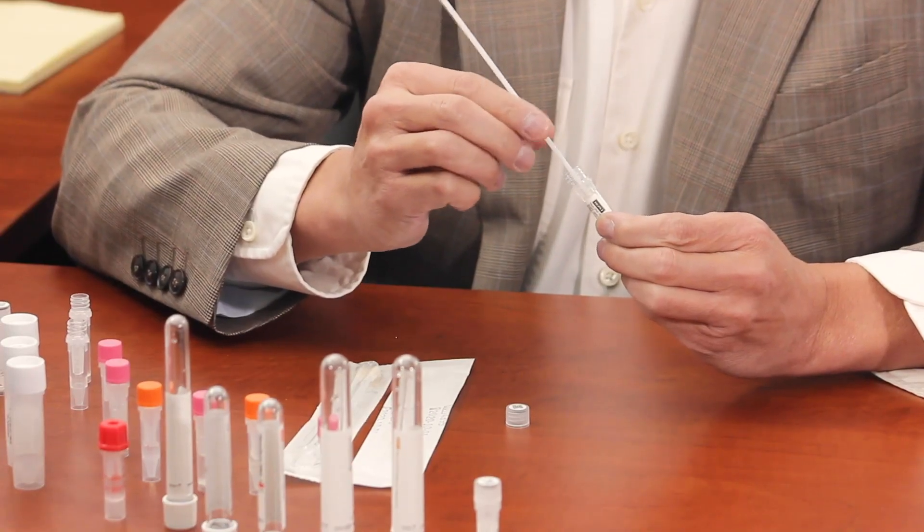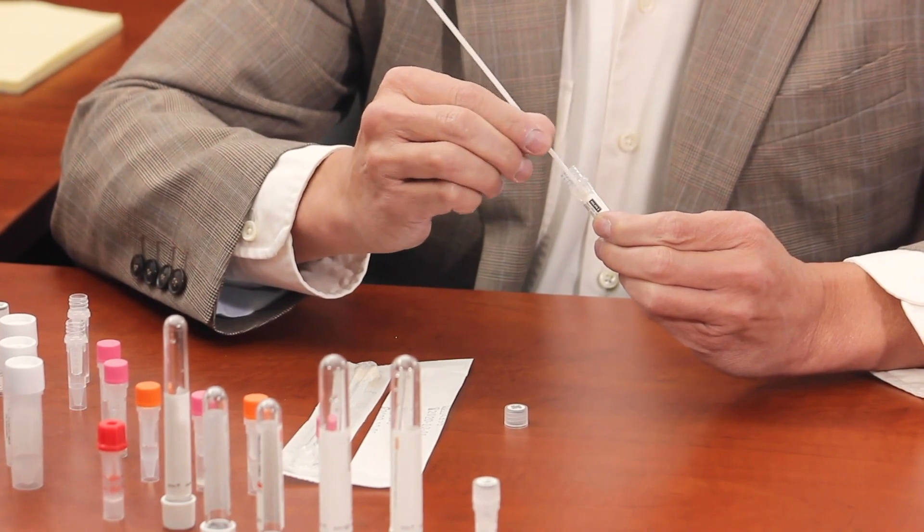What this does — it fully releases the collected material into the buffer. Once that's done, you slowly twist the swab out to remove any liquid, and the swab is then discarded.